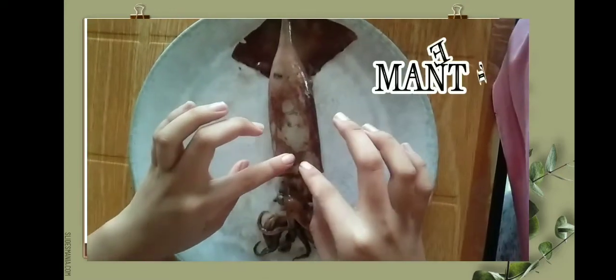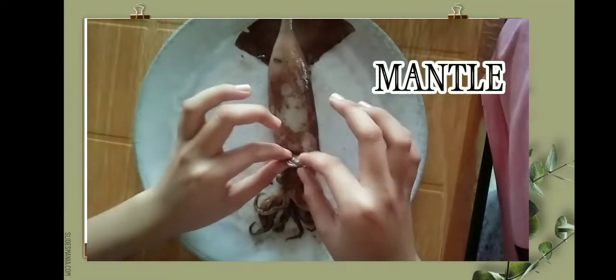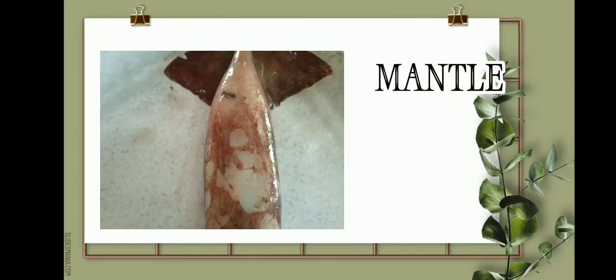While this part that I am touching is the mantle. It is the covering of the squid's body. It exists to protect its internal organs, and also it holds water and acts as a respiratory organ.